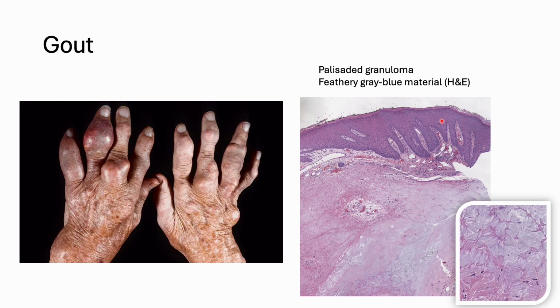They are not real uric acid crystals because the formalin during the processing will wash away all those uric acid crystals. If you really want to see them, you can do either one of two things. First, fix them in ethanol instead of formalin. Second, you use a very thick section and process them with the regular processor. If you go to Dr. Love's office, you can see on the wall there is a uric acid crystal. That is a picture of mine.